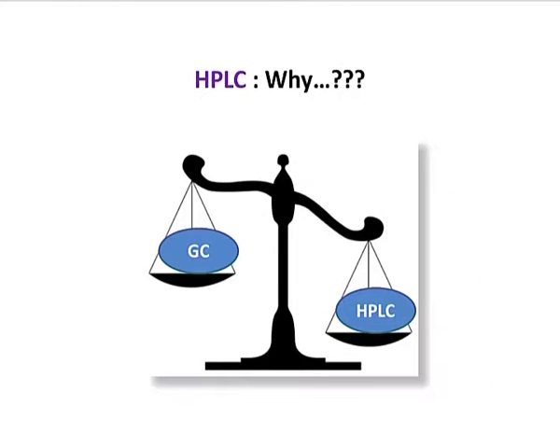Now, the third question, why? And I think I delved on this question a little bit in the previous slides. There was a need felt after GC was completely established. There are certain things which one cannot attain with GC, things which can be easily done with HPLC. Let me just show you.